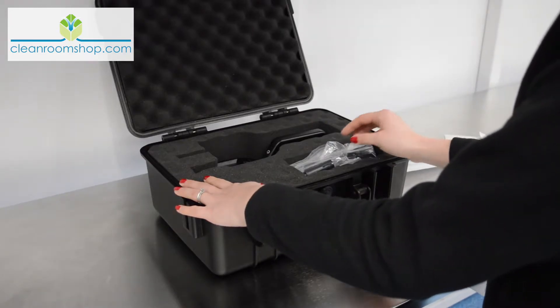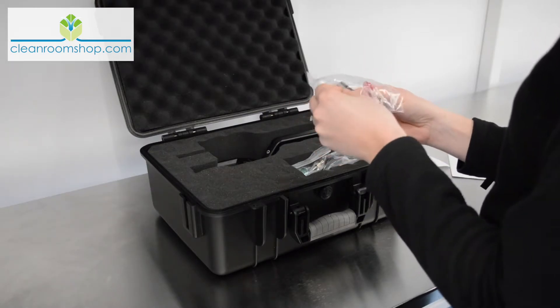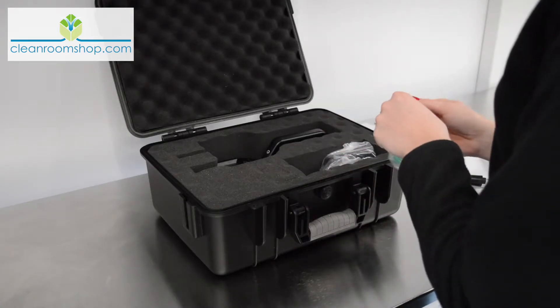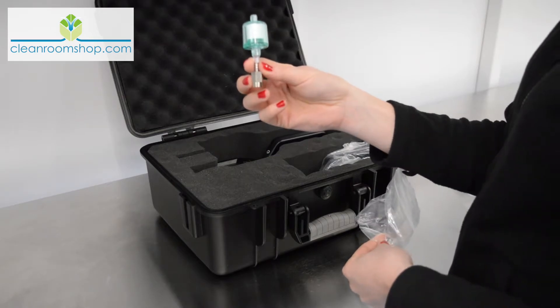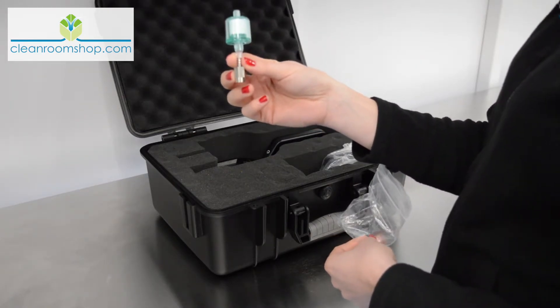Other components are packed in individual bags. There's a temperature and humidity probe, and a zero filter, also known as a purge filter. This can be attached to make sure you purge your chamber after using it in any particularly unclean or toxic environments.